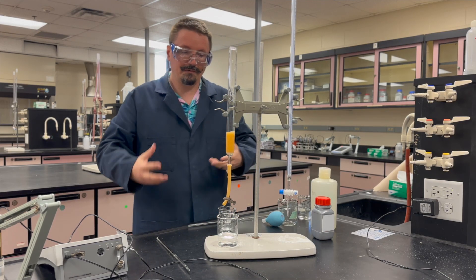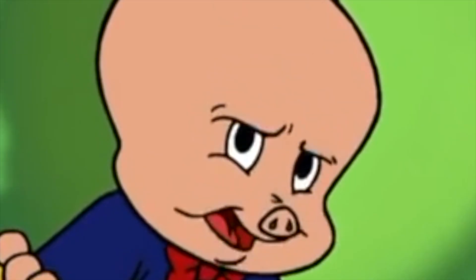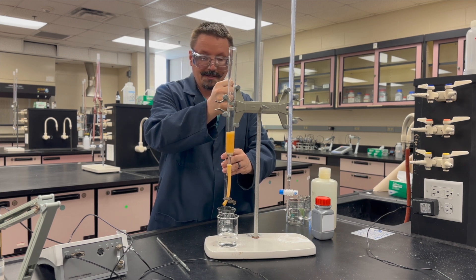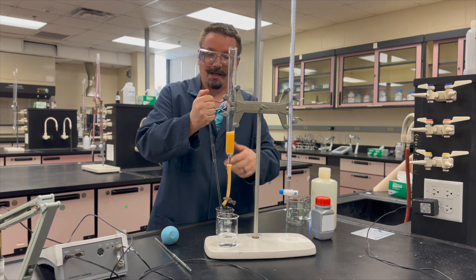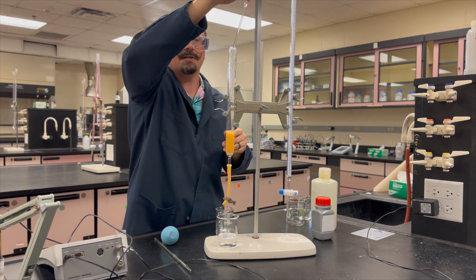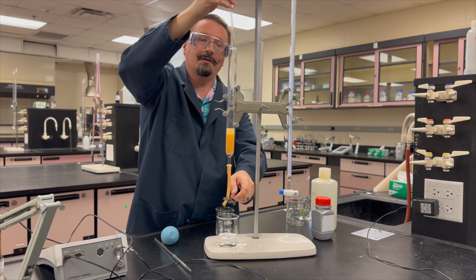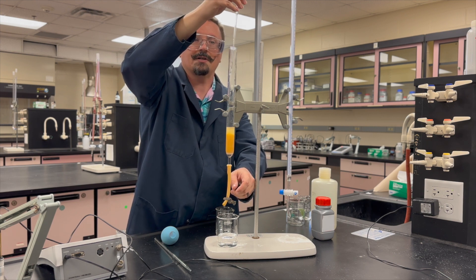Once your resin is wet and you've started conditioning it with HCl, keep the resin wet the entire time — don't let it dry out. If you can add the next aliquot of HCl, unknown, or water before it dries out, that's fine. If not, clamp it, add the amount, then unclamp. Whenever you add anything to the resin, add it around the inside walls of the column to avoid dropping it directly on the resin and cratering it — indentations or imperfections will result in a bad separation.